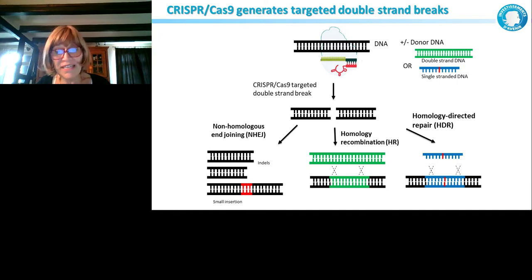But what we are really interested in is a specific correction, and that's done when we inject or electroporate or introduce Cas9 with CRISPR together with the donor DNA. This donor DNA can introduce the mutation we want. It's possible to use a single-stranded donor DNA or a double-stranded donor DNA. This event is definitely the one we would like to emphasize here. We are not so interested in the generation of NHEJ, but in generating precise events.